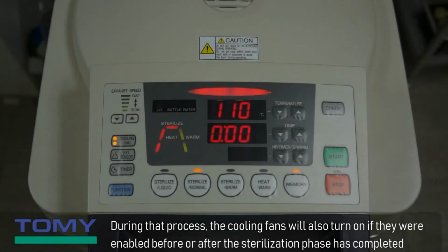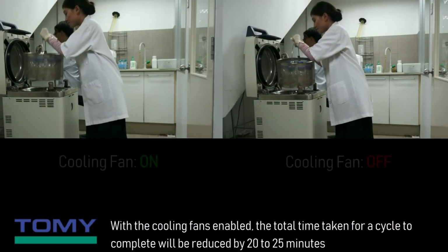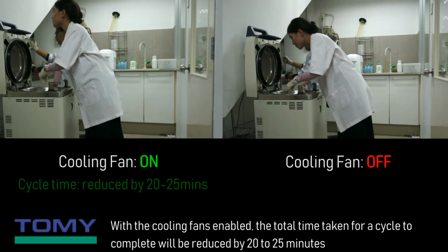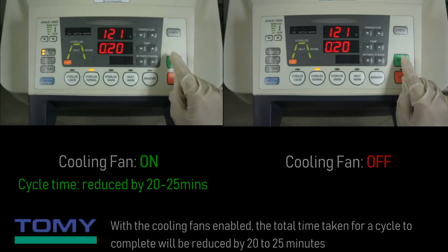During that process, the cooling fans will also turn on if they were enabled before or after the sterilization phase has completed. With the cooling fans enabled, the total time taken for a cycle to complete will be reduced by 20 to 25 minutes.